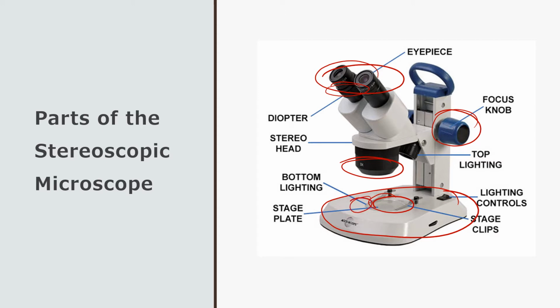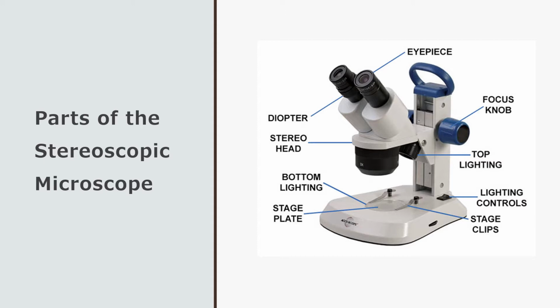It has a light source, a lot of similarities. Basically, it's the same type of equipment, but with some modifications. The first thing is that there's only one objective lens. Magnification changes, so you can view anywhere between like 10 to 125x magnification or so, and this takes place with a series of lenses that are internal, and you change the distance between them to change how magnified the image sitting on your stage is. So you don't have those objective lenses to swap out or rotate. It's all just sort of fixed.